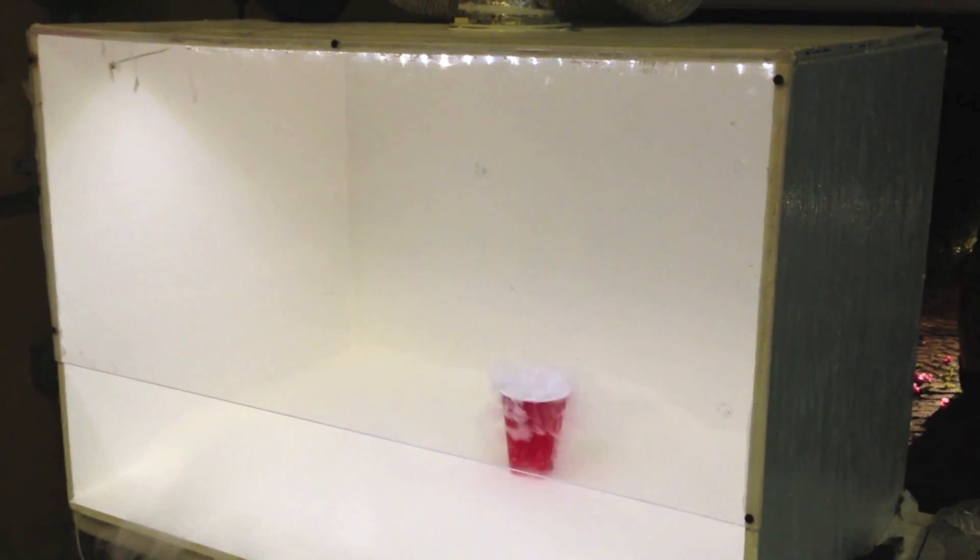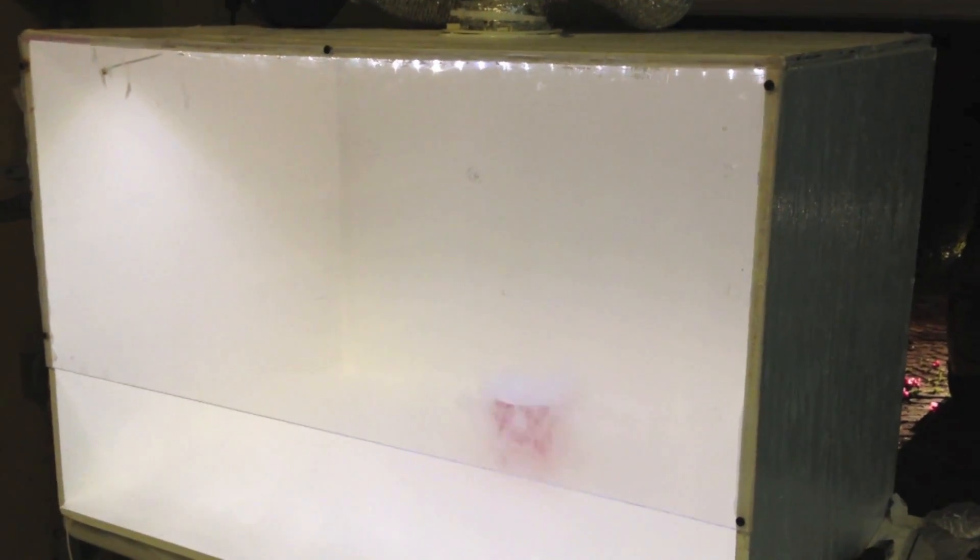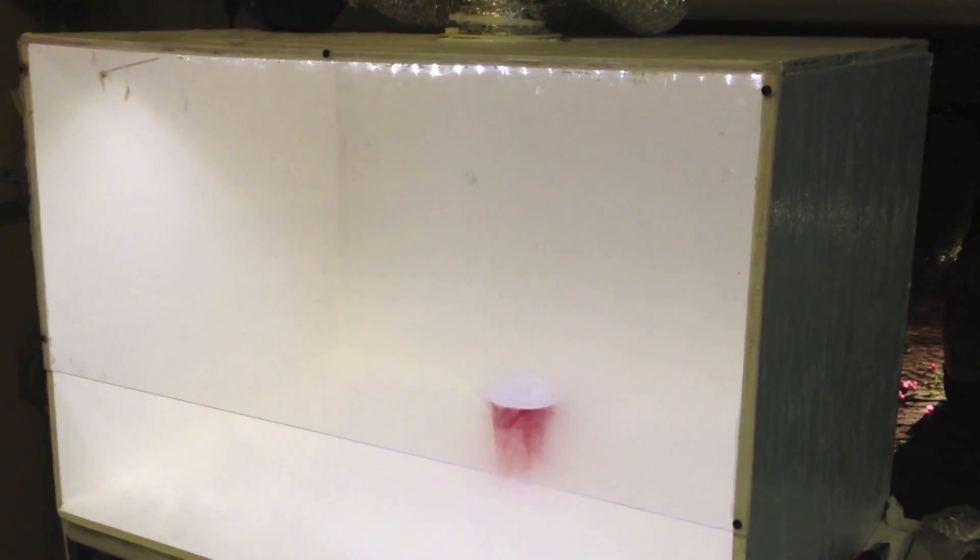Alright, so the fan is turning on. We can see that all the fog is now being sucked up and exhausted through the top of the hood.